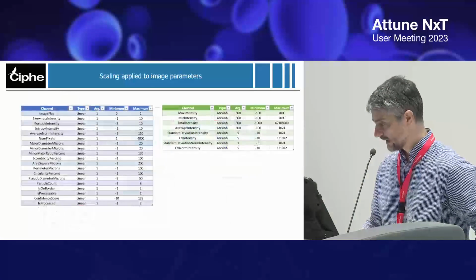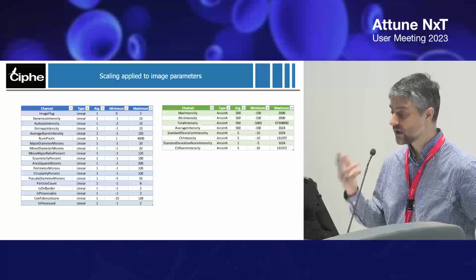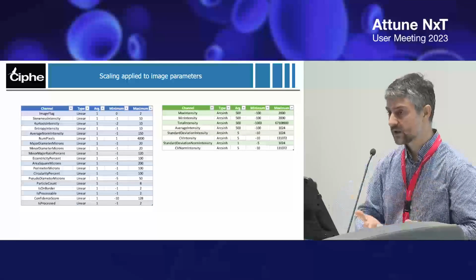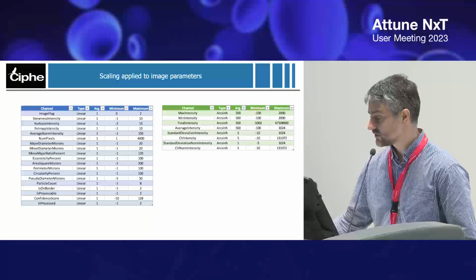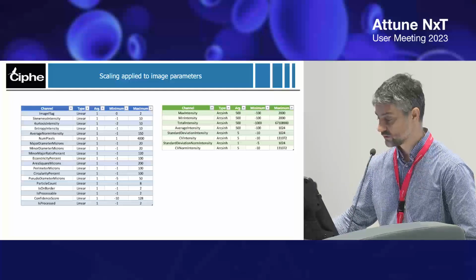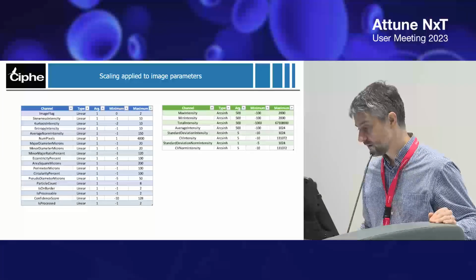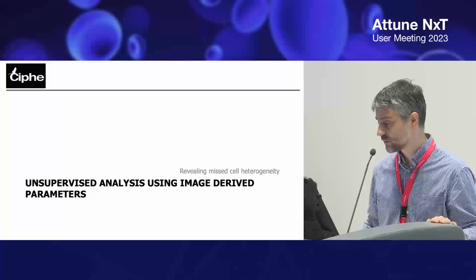So when you see this devil horn on your plot, you better try to understand why. I just want to make you aware of this. What I've been doing is finding the best transform for all these parameters so that I can merge them and include them in one analysis. I did that job already. And you see that, depending on the different parameters I'm looking at, the transform is not the same, so that I bring them all to a kind of equivalent level for the analysis step. No one will drive the analysis more than the other.